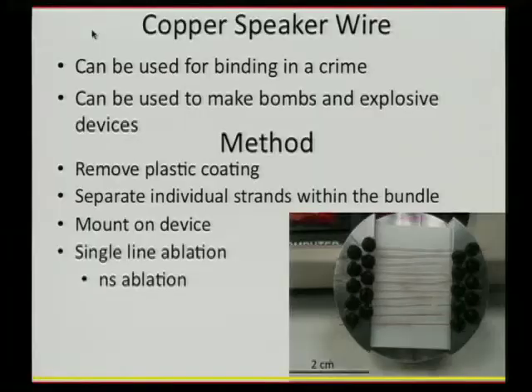Then we had one of our summer students actually make this device, and this is just meant to keep the wires straight. And so we would mount these individual strands onto this device, and then we would do single line ablation using our nanosecond laser.